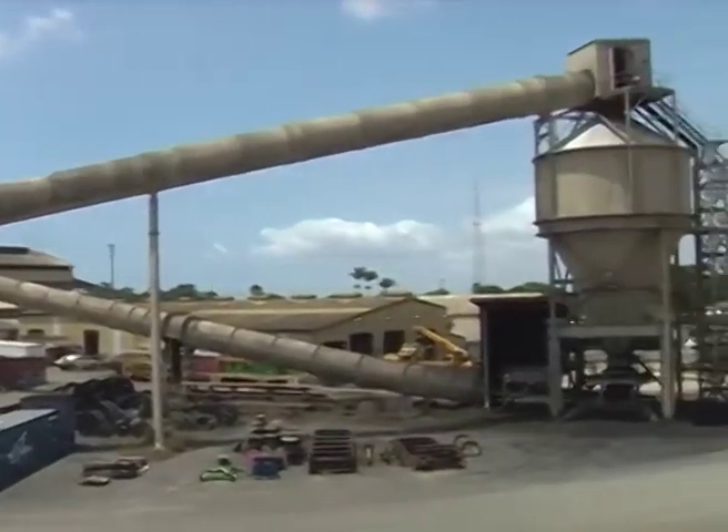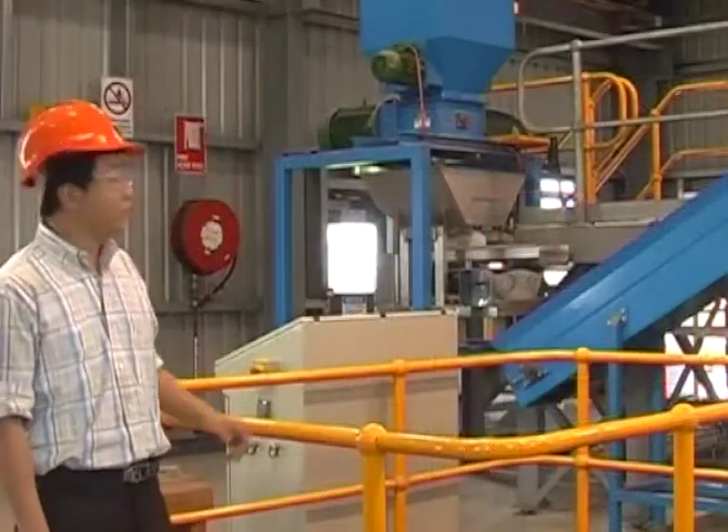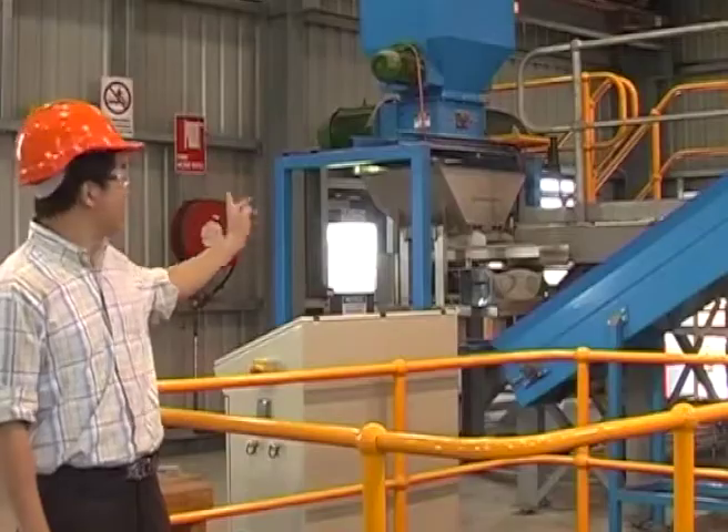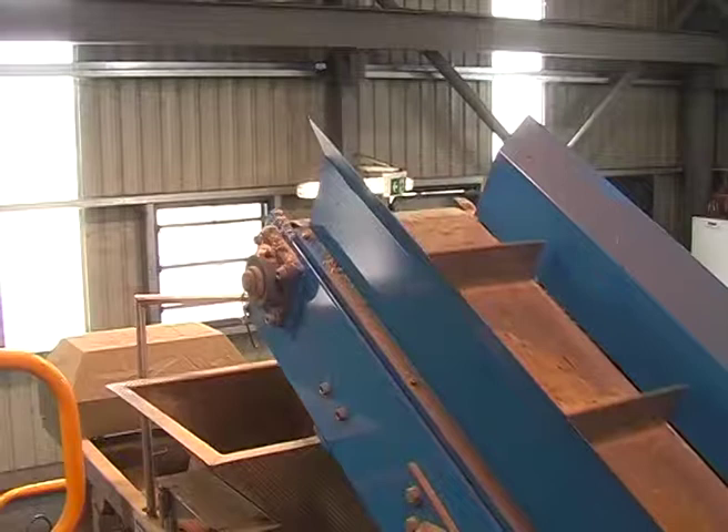We load the bagasse into this hopper and then use a conveyor to transport it to the reactor and load it into that reactor.